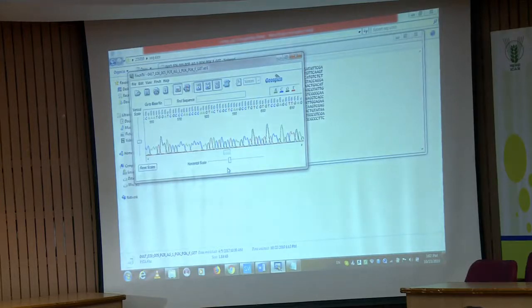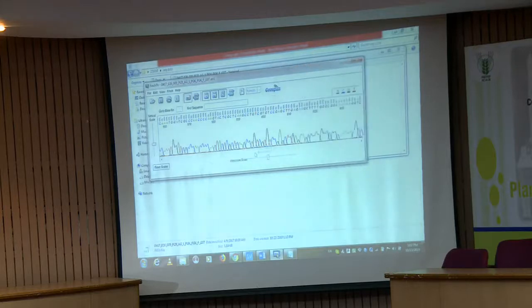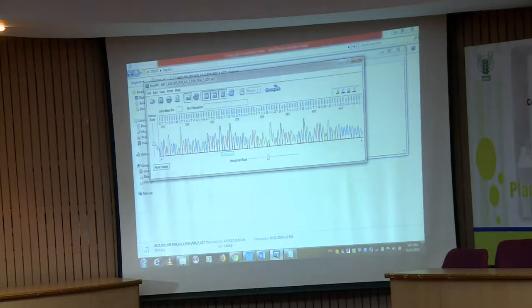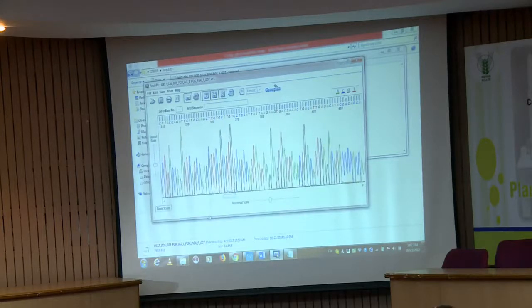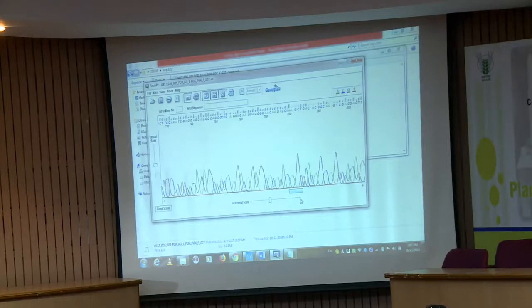Why I told you in the beginning that company people commit only 500 to 600 good bases, because what happens in the instrument is that after 500 to 600 bases, the peak resolution declines. Now you can see the clear peaks, right. In the beginning, if you have seen, those are very crisp peaks. But if you go forward and go beyond that, can you see the resolution of the peaks starts declining after around 600 to 700 bases.